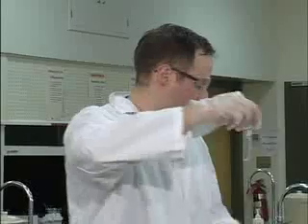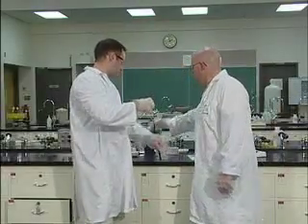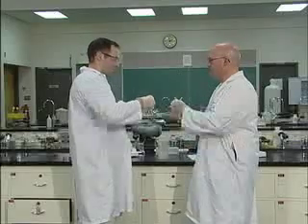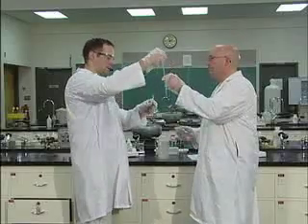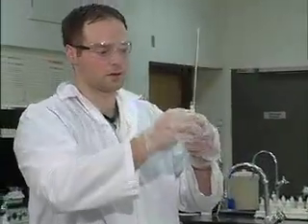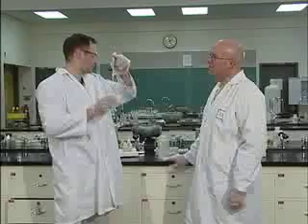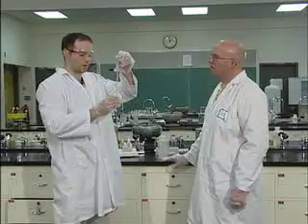That's just water. What you're going to do is you're going to put your thermometer. Oh, that was close. You don't want to break that. You're going to put your thermometer into the test tube. And you'll notice it gets very, very close to coming out the top. Now what you're going to want to do is read the temperature of your water. So just put your thermometer in there for a couple minutes.